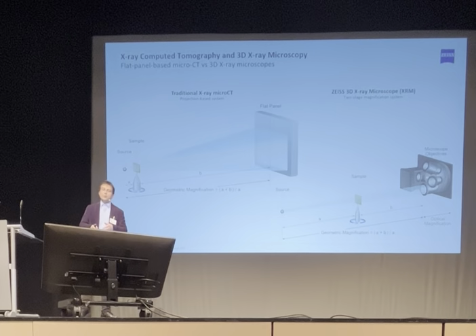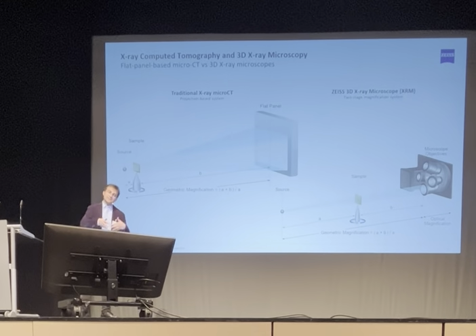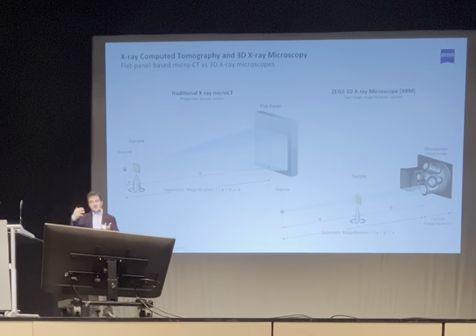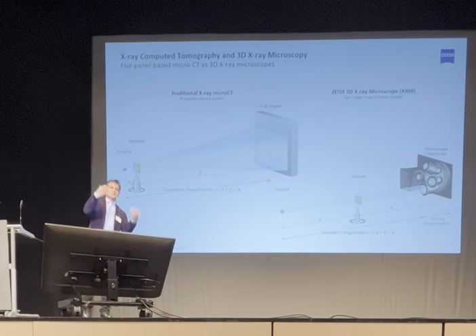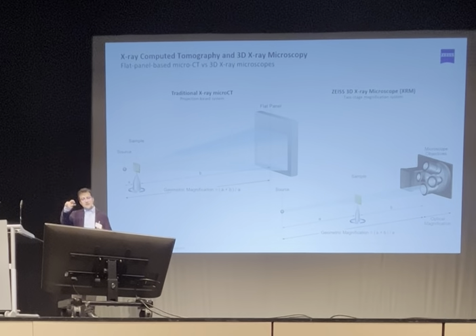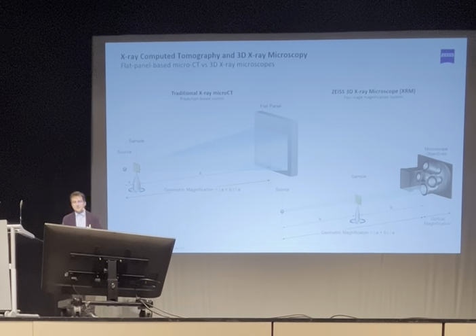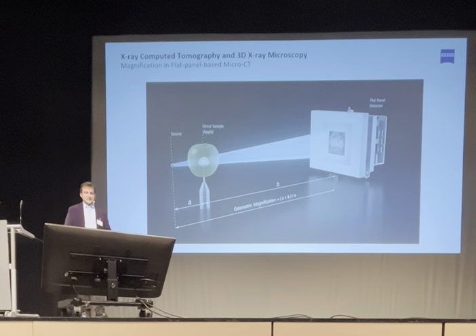And it's this that will enable the system to achieve higher resolution without destroying the sample, something that we call resolution at a distance, because by switching to different lenses you can zoom in on a specific area and increase the magnification. And there is a clearer explanation in this video.